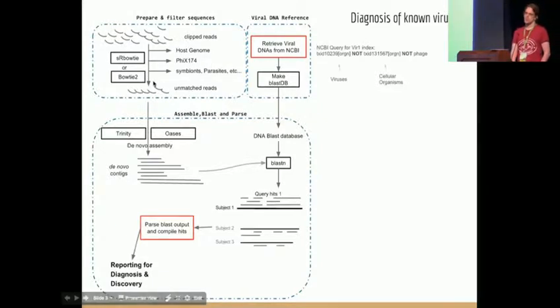Depending on what you have sequenced, if you have sequenced samples from a specific species, you have already discarded the majority of reads, and you can now focus on the interesting things, if what you're interested in is contaminating reads or viral reads or however you want to call those.